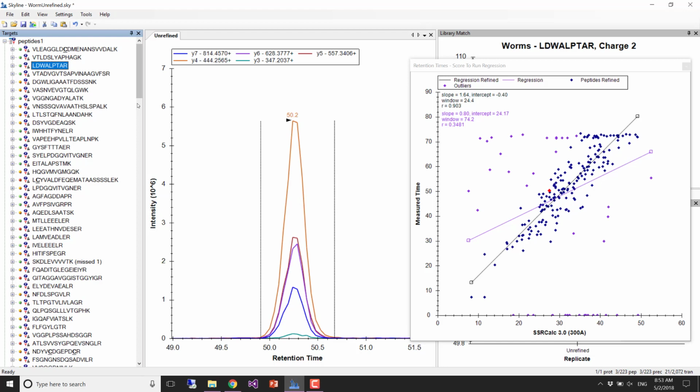Suppose we wanted to measure a specific protein. If you know that there's only 20 potential peptides that you could measure, you could measure all that in one run and figure out which are your best responding peptides, and then move on from there. So we're sort of simulating that type of thing.